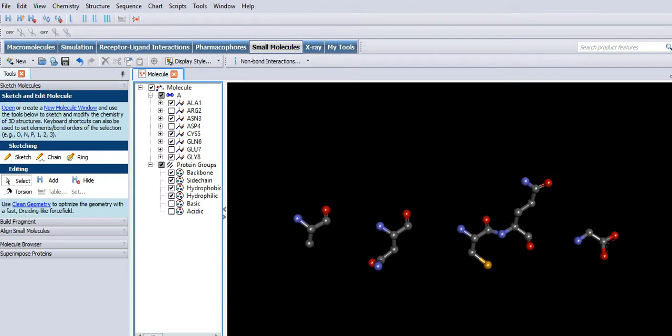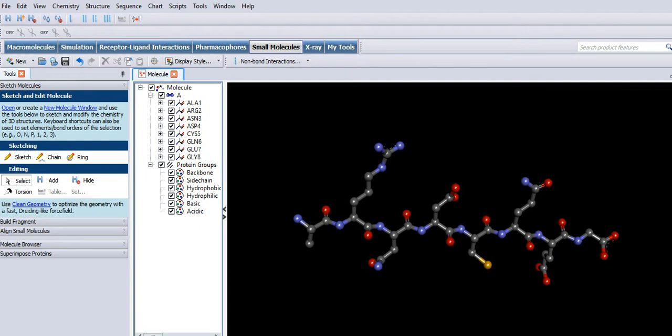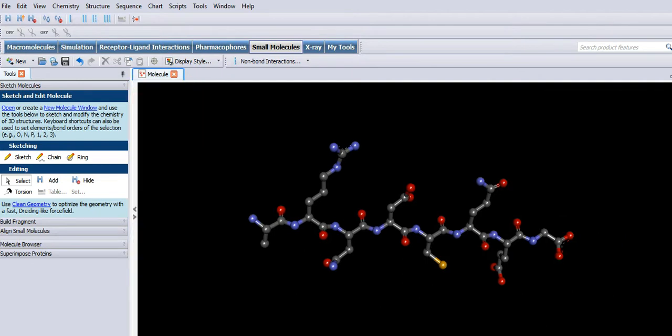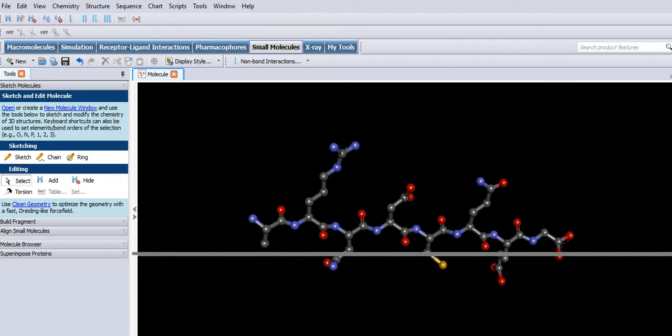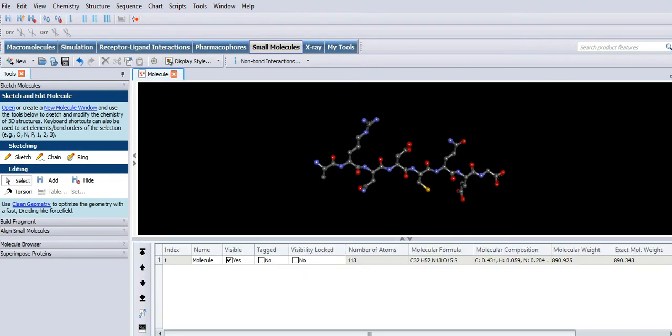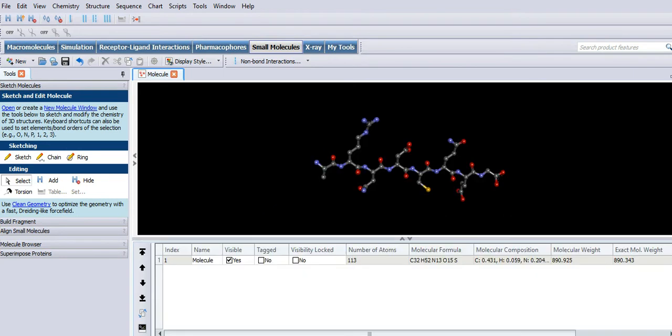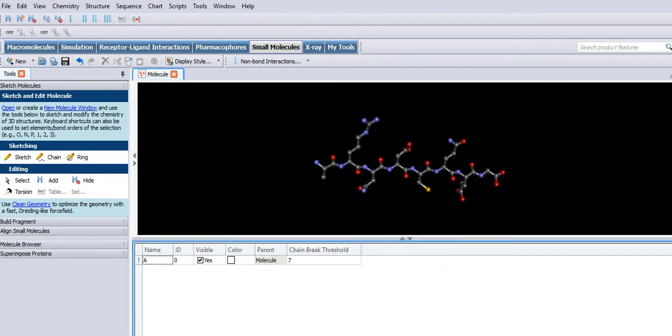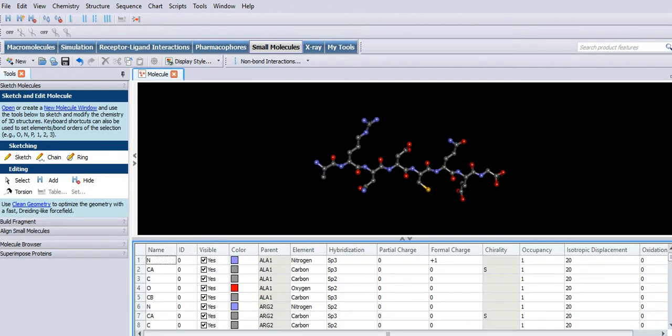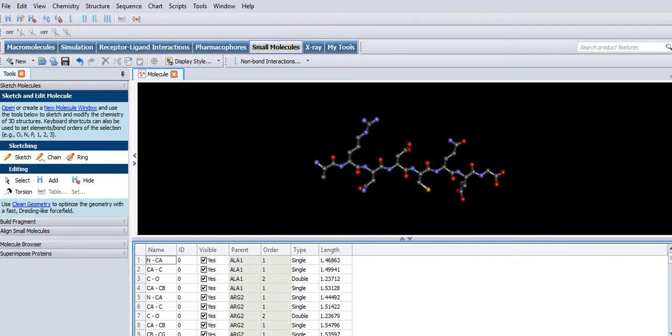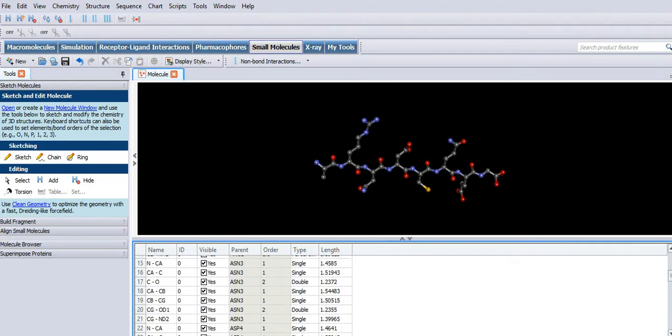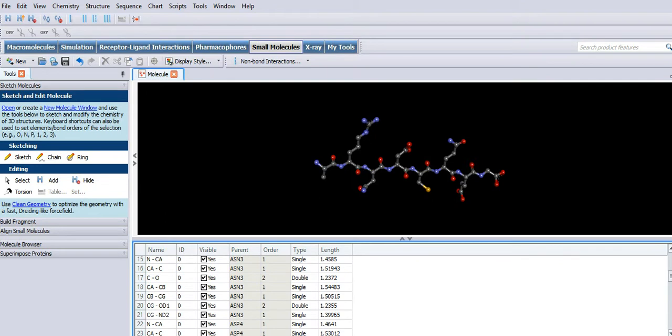Come back in and there's more information here at the bottom of the screen. We know as a chain atom, so the hybridization is useful there and bond lengths. Very useful as well. They're all listed there, so very useful little piece of information there.